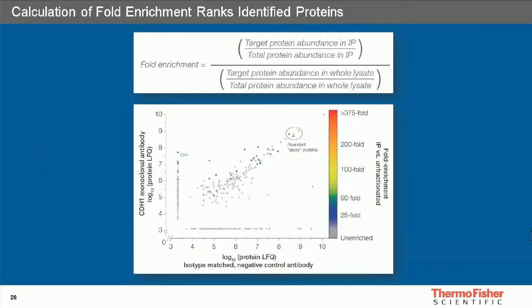The second question we wanted to ask is not only how you identify your target, but how you assess the other proteins that interact with the antibody. Because when you are doing a Western blot, you are using BSA or milk to block everything else that's around. With mass spec, you are going to see everything that's present after you perform the IP using a specific antibody.